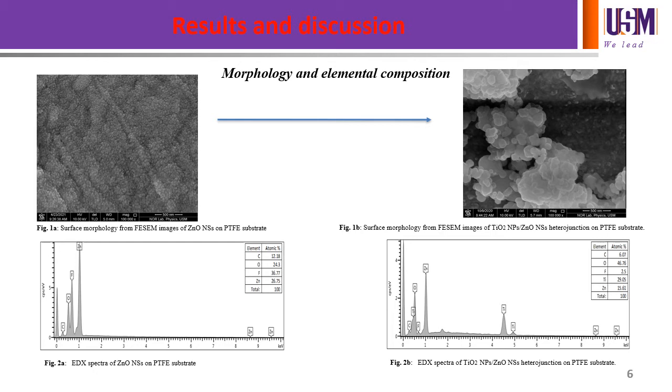Figure 2A and B elucidate the atomic percentages obtained by EDX for the sample of the zinc oxide nanoseeds on PTFE substrate, and the sample of the heterojunction synthesized on PTFE substrate, respectively.